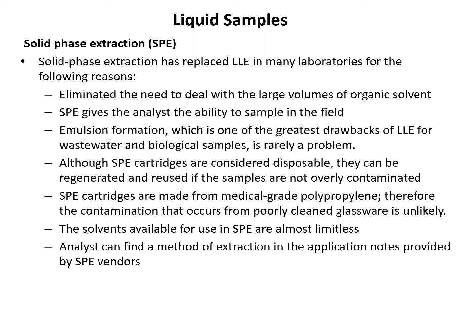So class, SPE has replaced LLE in many laboratories because in SPE we can reduce the large amount of solvent usage. SPE also gives the ability to carry out the extraction in the field, and we can avoid formation of emulsion as in LLE, especially when we are analyzing wastewater or biological samples.